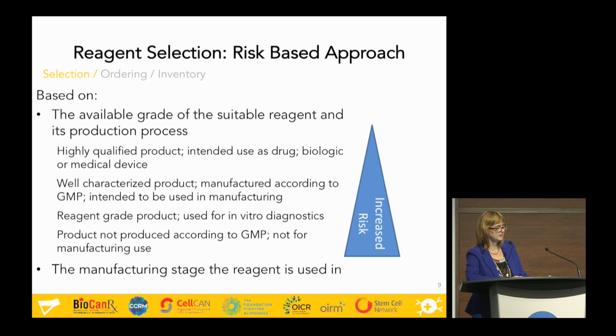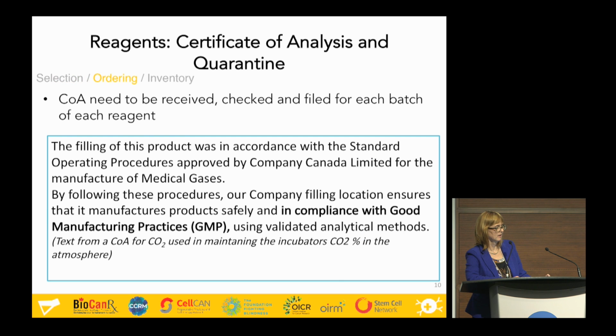So with increased risk come more tests, but it means that once you have qualified your reagents and have them selected, you add them to the list of your approved reagents for your clinical trial, and it's only those drugs that can be used in your manufacturing process.